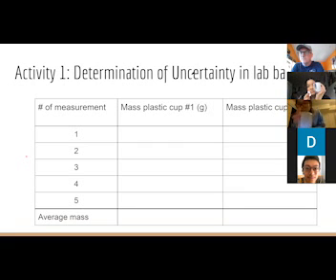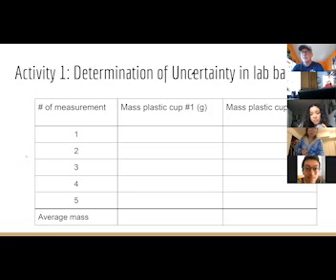Mm-hmm. How do you do it? It's like you sort of have to slide it out. Slide it out? Yeah, you just pull those to the side. At the back. I don't. Yeah, press in with your thumbs and then pull outward. Oh yeah, sorry about that. Yeah, you have to put your thumb in between, like you see the little indentation closer to the center. You kind of have to put your thumb in there, in between. Okay. I'm probably just not lining it up, but I'll get it.